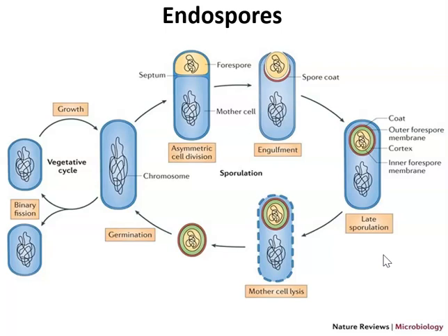It's essentially that. Except bacteria are capable of producing spores at any time where the conditions are no longer optimal. So if the pH has changed or they're low on food or water, anything like that. And bacteria are not necessarily doing these processes all at the same time. It's not a seasonal thing. And that's why you may very well see cells at different stages of sporulation and germination all on the same slide. Even though it's a pure culture and the cells are all from the same species, they may end up looking really different if they're in different stages of sporulation or germination.